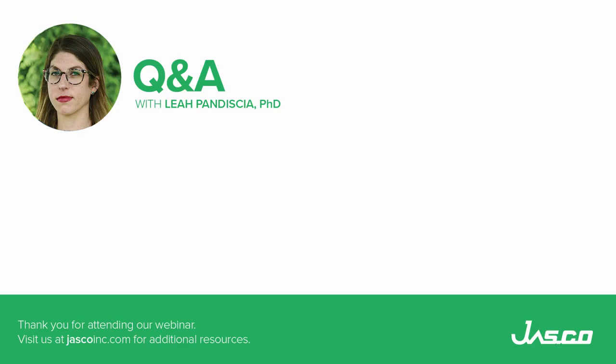Focal point. Oh, sorry, wrong column. Thanks, Joe. I thought it sounded wide. Yeah. Well, so around 1 to 2 millimeters. Sorry. Again, we have a chart on this if someone really wants to see it, depending on what they're doing overall.